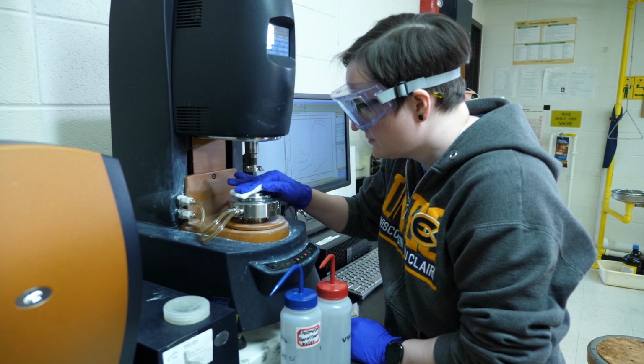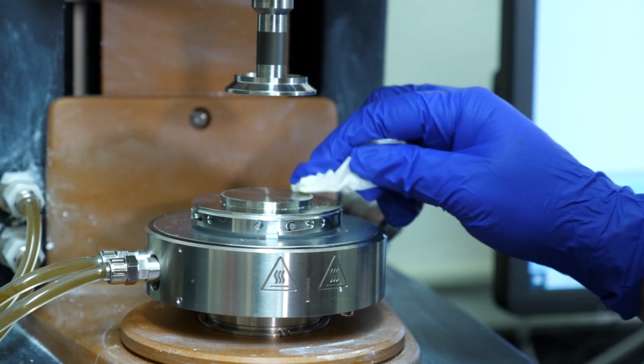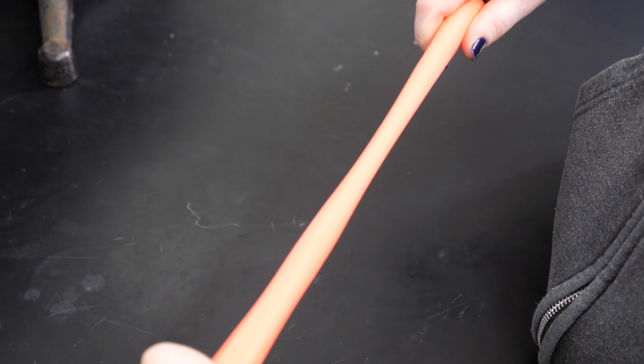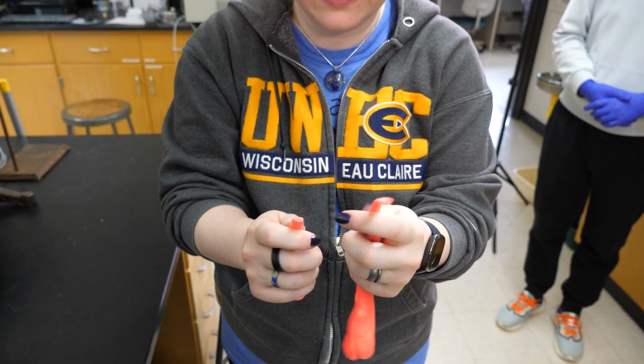I've been doing what's called viscoelastic testing using this rheometer right here. The rheometer is used to study the rheology of a polymer, which is the flow behavior. Specifically, the kind of stuff I've been testing is the viscoelasticity of these polymer solutions. Viscoelasticity is like the time or shear dependent response of a material to stress. Like if you think about silly putty, if you just kind of stretch it, it'll flow. But if you go like this, it snaps.